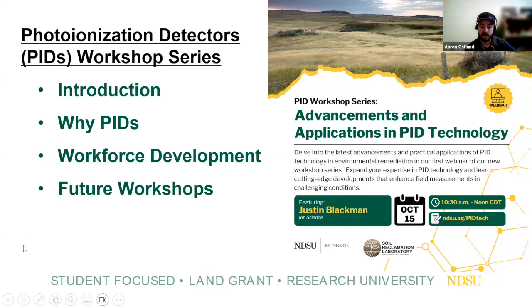Justin Blackman is joining us today from Ion Science, which is a leader in PID technology. He has served in multiple roles over his 25-year career with Ion Science. His technical expertise spans from electrical engineering and high-level instrument calibration for oil and gas applications. Over his career, Justin has worked closely with clients to optimize their use of PID instruments, ensuring that they get the most accurate and reliable readings in challenging field conditions. And with that, I'm going to pass it over to Justin.